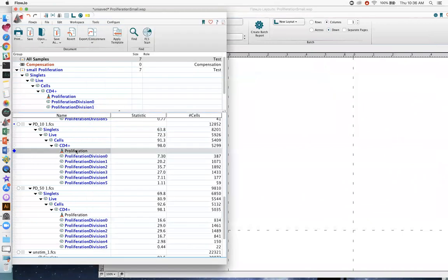Okay, so we do have a question here, but I'm going to jump onto the table editor, and I'll come back and answer that question for you in a moment. Okay, so to open up the table editor here at the top, right, you'll see this screen looking character. Right next to the L, this is where we go to export our Excel files or CSV files. This is where we export our statistics from FlowJo.